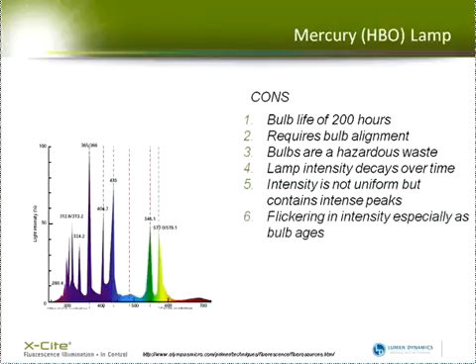The bulbs can also flicker, especially as the bulb ages. Again, the spacing between the two electrodes widens, so you get flickering or slight intensity variations on a fairly fast time scale, which can affect quantitative imaging.